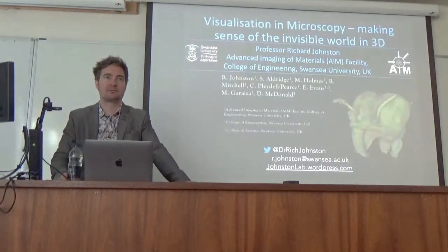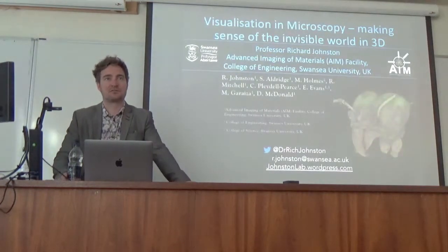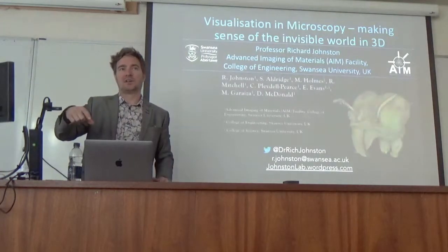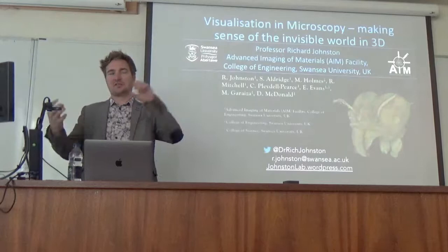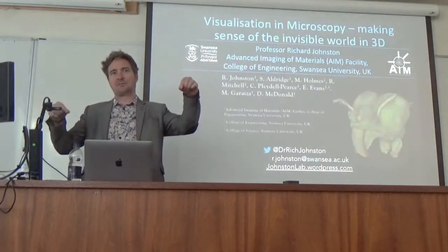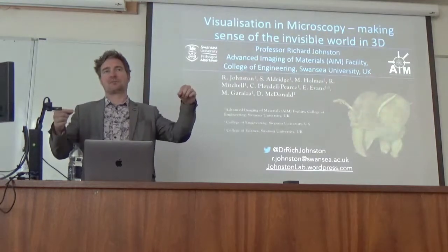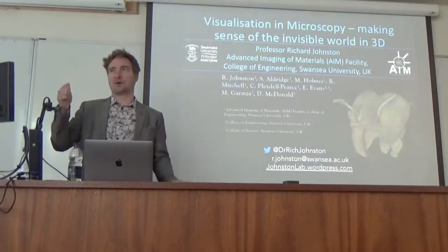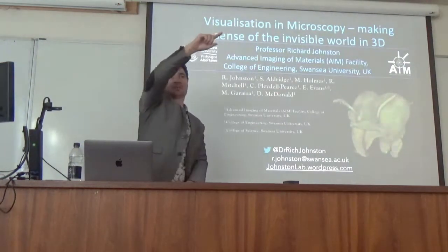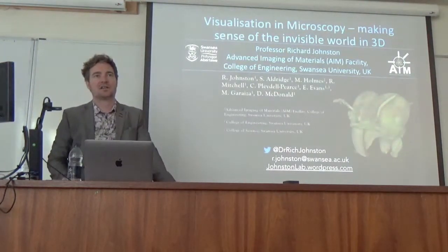Most people are doing landmark measurements in biology based on either the actual thing that you can put calipers on, or something else. It's quite difficult to measure things in three-dimensional space. You can put a little point here and there, but was the angle between them the widest point? There are some algorithms that can do that. Whereas in VR, you know the anatomy, and you stick the first point there, and you move along, and you put your next point there, and it measures. So, yeah, I think it can be quite useful. It's definitely not a gimmick, VR, within microscopy.